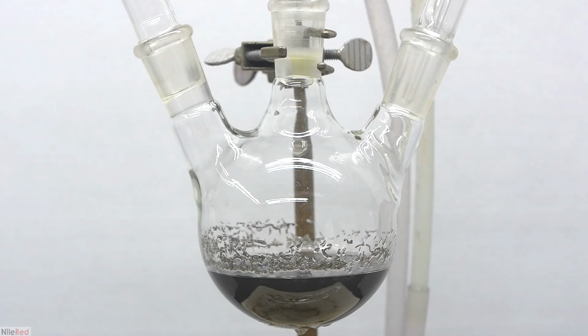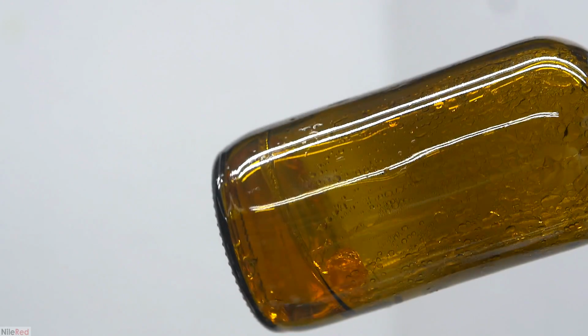Eventually, we get to a point where the reaction dies down and stops, and we have finished making our Grignard reagent. The next thing that we need to do is add in a molecule that we want to couple this Grignard reagent to. As I said before, my original intent was to couple it to acrolein to make 1-octen-3-ol. However, when I went to go in and use the acrolein, I found that it was polymerized, and let's just say I was slightly disappointed.